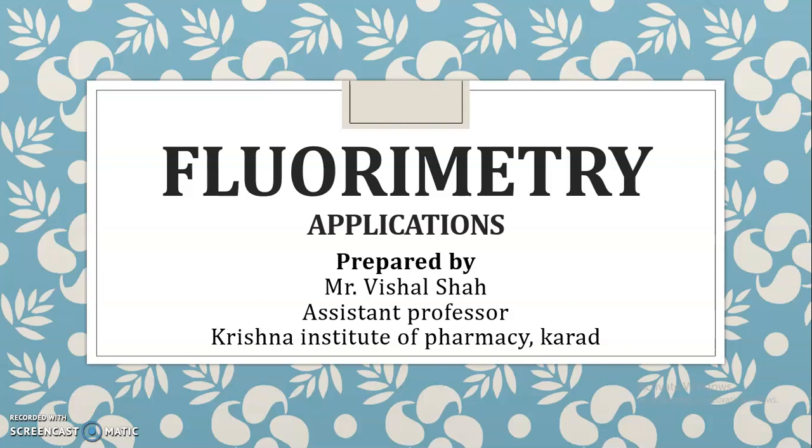session on the Fluorimetry. In this video, we are going to focus mainly on the applications part of the Fluorimeter, as well as what is the meaning of quenching of fluorescence, and we will see what is the difference between the single beam as well as the double beam Fluorimeter. In the previous video, we have seen in detail the instrumentation of the Fluorimeter.